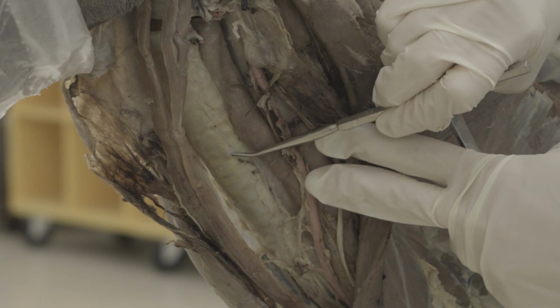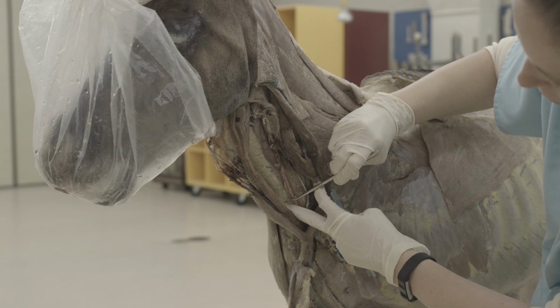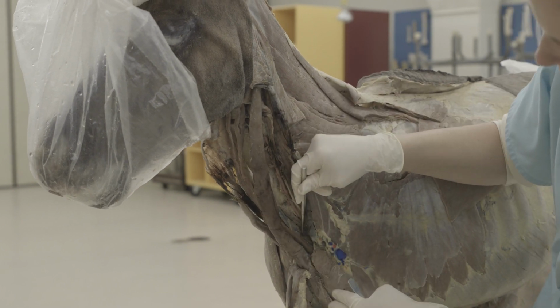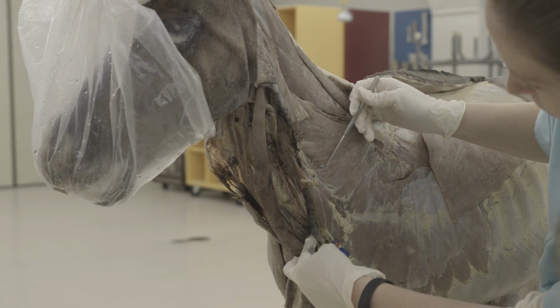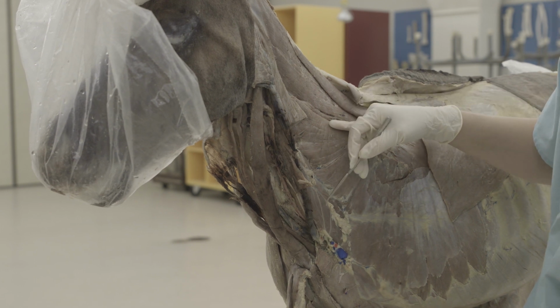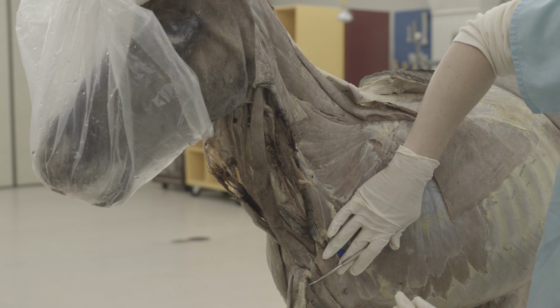So there's one little tiny one here, and there were some more down here, very small. Those would be middle deep cervical lymph nodes. You also have caudal deep cervical lymph nodes that would be farther back. But we don't really have those visible here. So if you can find some, that's great. If you can't, don't worry about it. And then the superficial cervical lymph nodes we'll look at on the other side because they were taken off with the limb on this side.